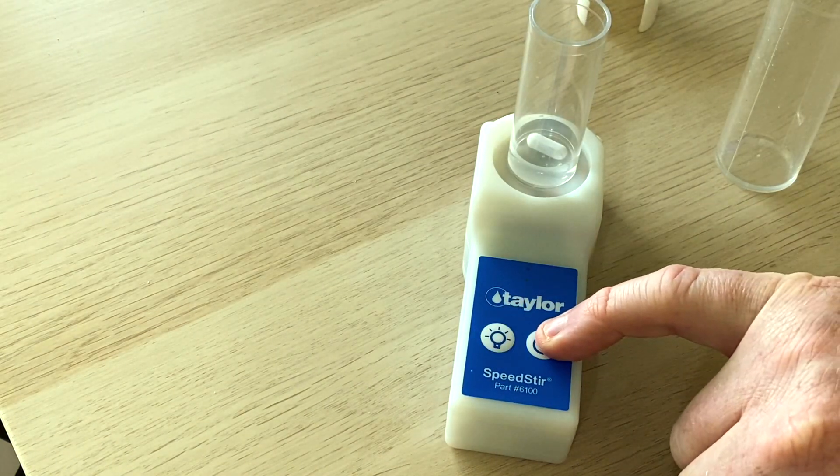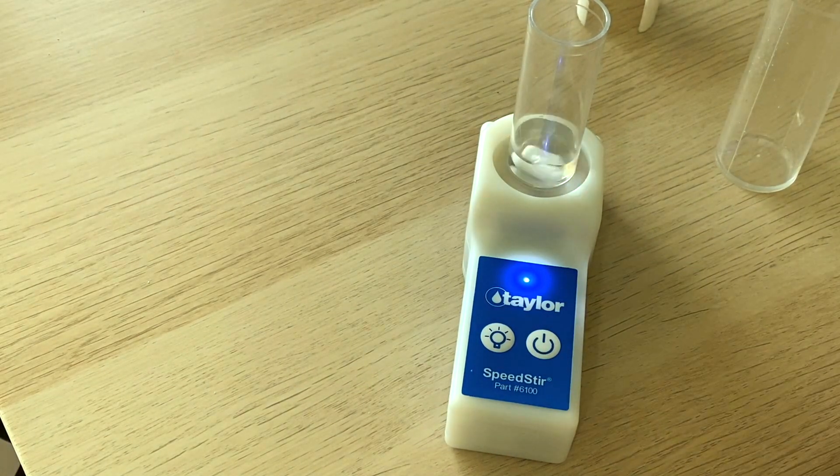I'll turn the light off just to give you a good visual of what it's doing, and then we'll grab an alkalinity test kit from Aquaforest and I'll show you — even in slow motion — how this bad boy operates.